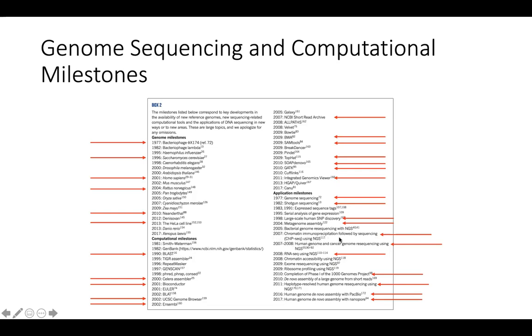So that is the sequencing of epigenetic markers. I do not know if this was done with histone pull down or DNA methylation, for instance, but that's what this is telling us. Then RNA-seq is pretty new.